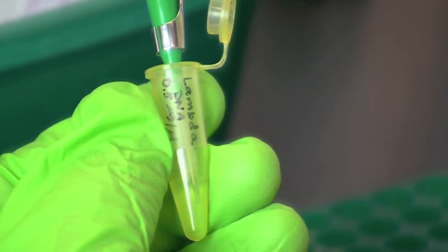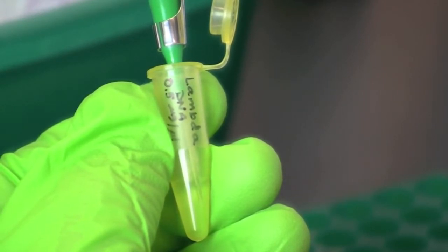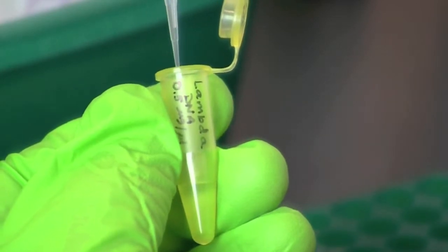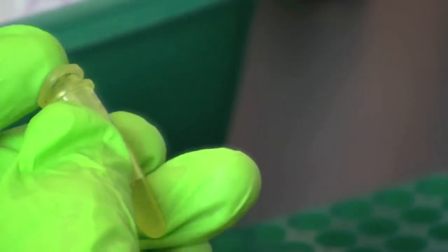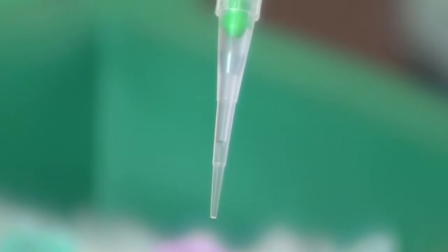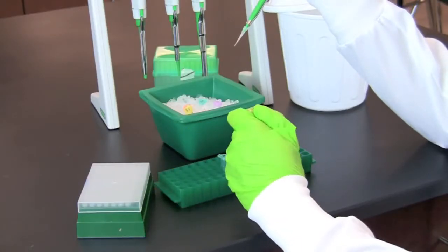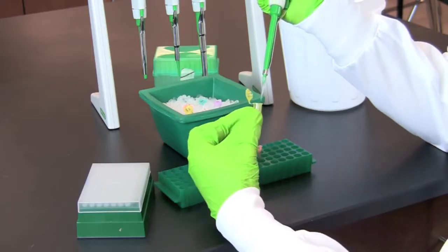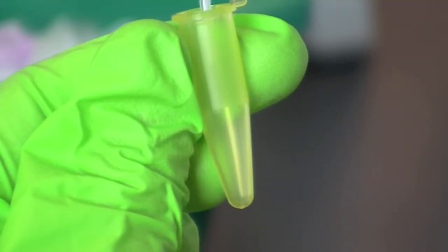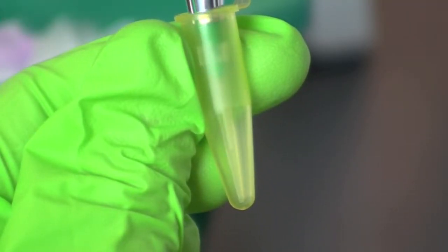When obtaining your sample, work at eye level so you can be certain your pipette tip is in the sample. Look closely at the tip to make certain you have obtained the correct amount of sample. Then transfer the sample to the matching color-coded tube, placing the tip near the bottom of the tube at eye level to make certain all of the sample has been transferred.